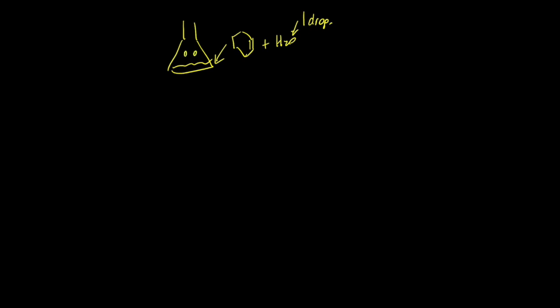So these calcium chlorides are beads. Okay, they're going to go down into the bottom layer, not really floating in the air like that. And then we're going to filter this out, okay? And we're going to get the calcium chloride, which is going to be absorbed with the water.